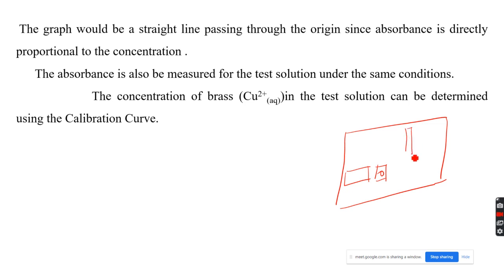Here there are two knobs, one is a wavelength knob, another is the filter knob. Then in the hole we introduce a cuvette tube. Here first we'll press set and make it a 0 reading. Then we'll introduce the lowest concentrated solution, say the solution which contains 2 ml.